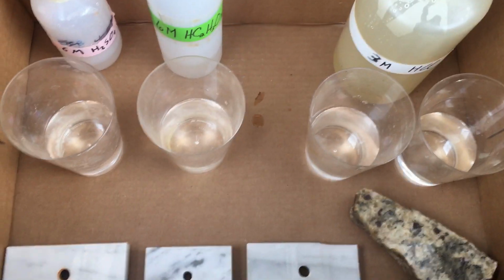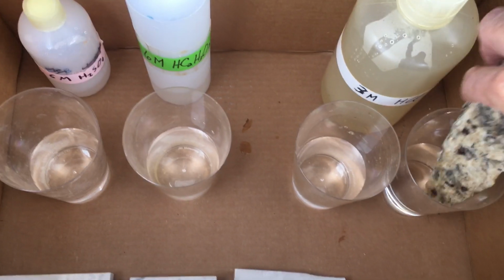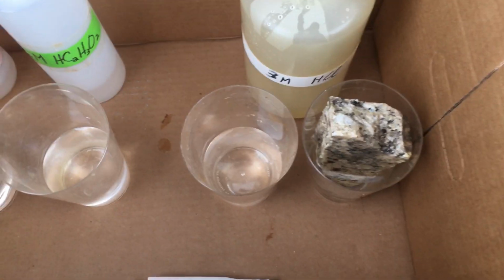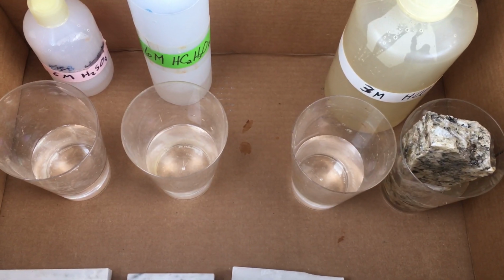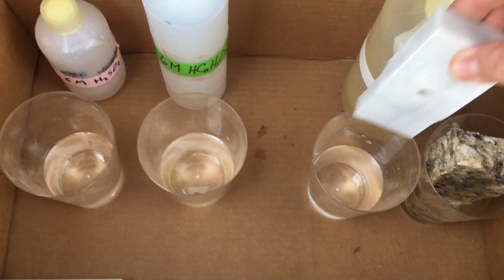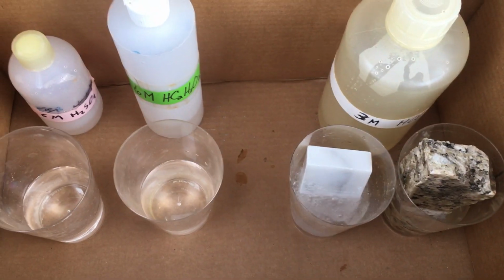of granite. And so what I'm going to do is take that granite sample and put it in the hydrochloric acid. And looking in here, we don't see a whole lot going on because, well, aluminosilicate doesn't react very readily with any sort of acid. Now we're going to take a sample of marble and put it in this hydrochloric acid, and we can see that there's a reaction taking place.